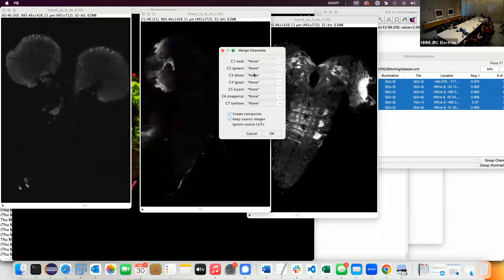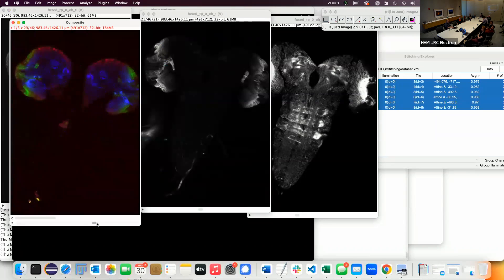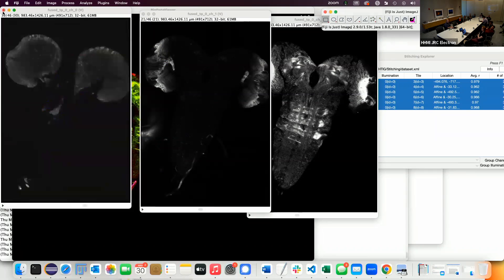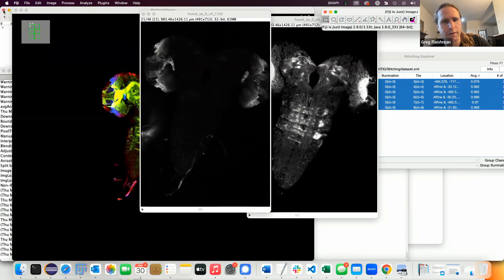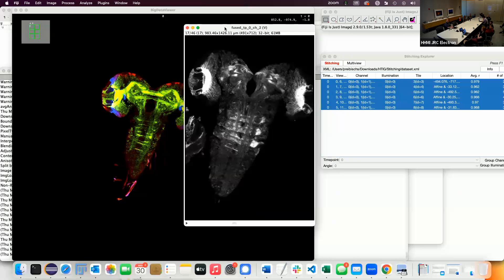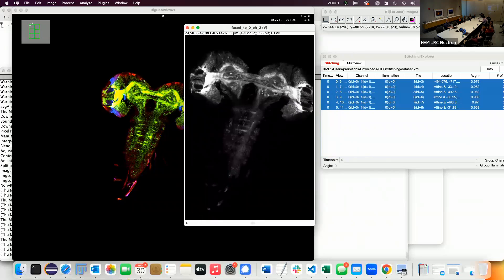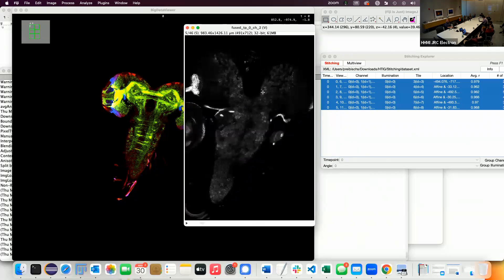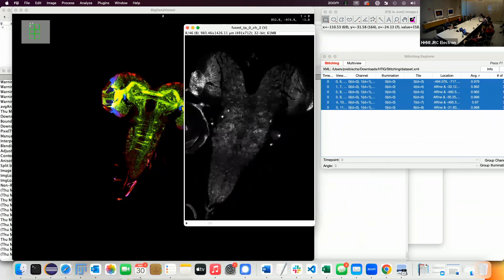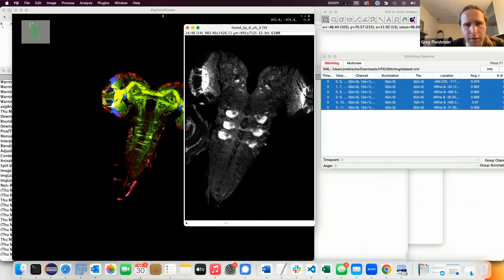Then you do Image > Color > Merge Channels. In this case it will actually make copies. There's your fused dataset. I want to call it the optic tectum but that's because I do zebrafish — I think it's the optic lobe here. They look kind of distorted but that's just what's in the data. That's how it looks — and that's not even close to an overlapping tile boundary, it's just how it looks.